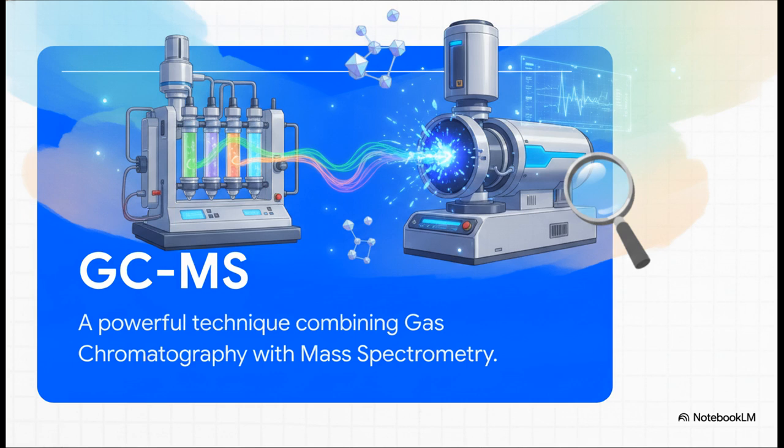First, the gas chromatography part separates out all the volatile compounds in a mixture. Then, the mass spectrometry part steps in to provide highly sensitive, incredibly precise identification of each and every one of those separated compounds. Put them together, and you get exceptional sensitivity with dead-accurate compound identification.